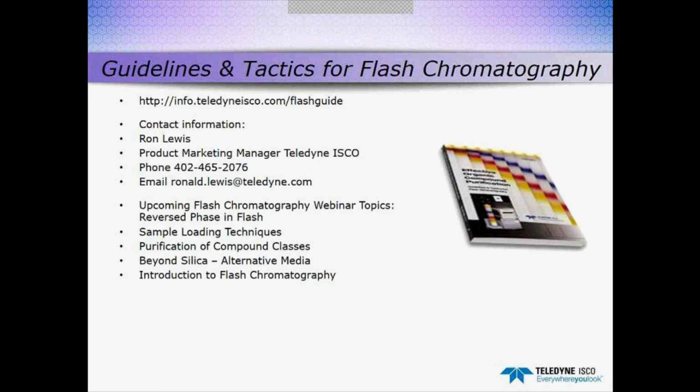What about the solvent grade to use with the EZ Prep? Do you need to use HPLC grade? If you run the flash side, typically we don't use HPLC grade. We use the lower technical grade, which is used on the flash side. We use that on the HPLC as well. If you're using the mass spec for detection, it requires a carrier fluid, and with the mass spec, the carrier fluid we normally recommend is mass spec grade solvents. But for the purification part of that, with the mass spec interface, we still use technical grade.